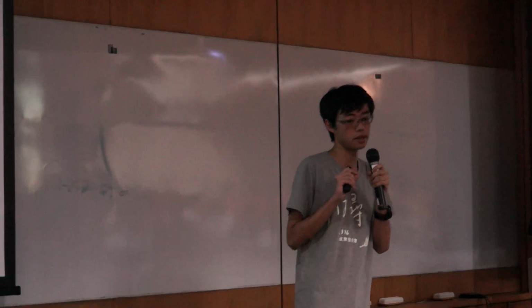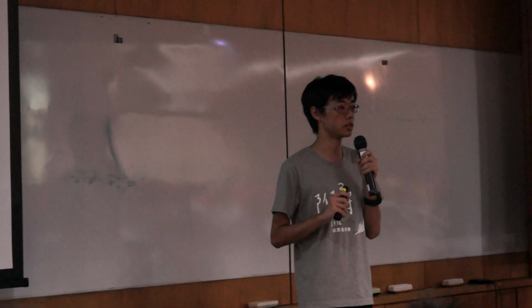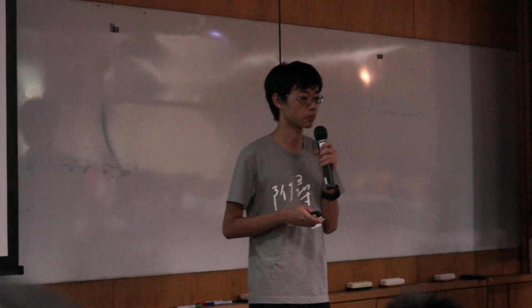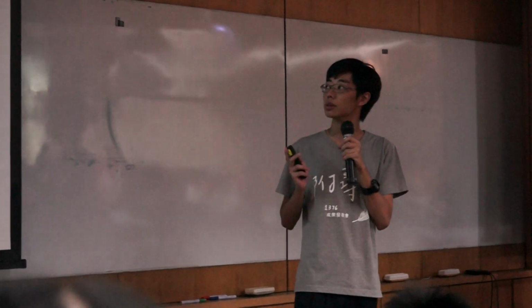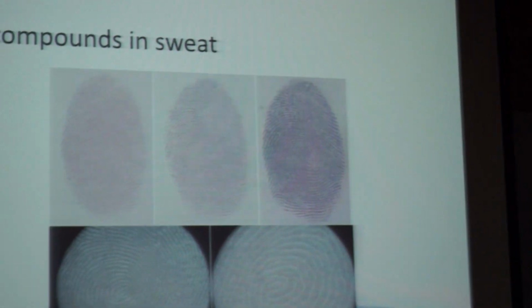So you might see police using a brush and brushing everywhere. They are actually detecting the latent finger mark. And in our experiment, we want to use nano gold to replace the powder. Next, this is what we got.